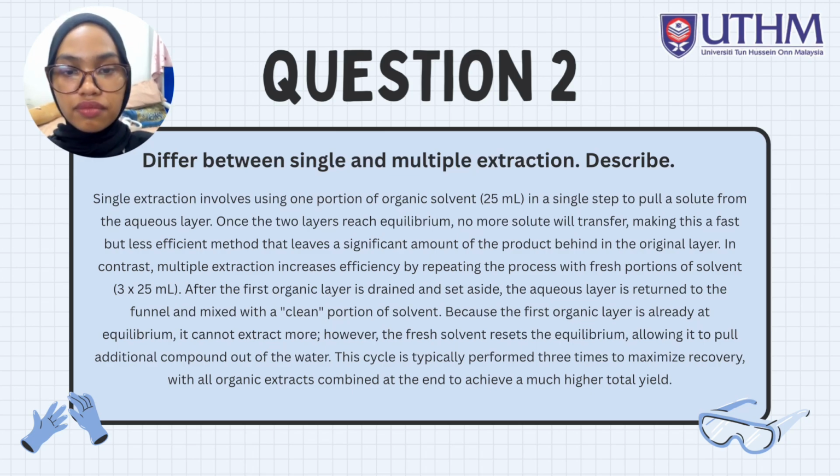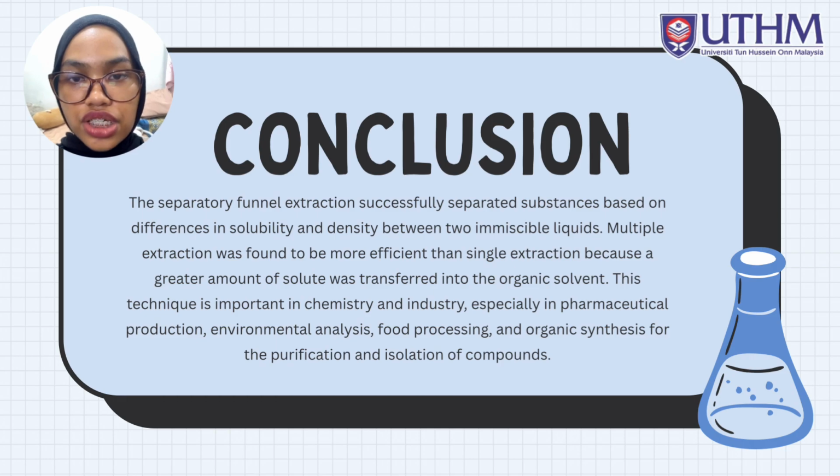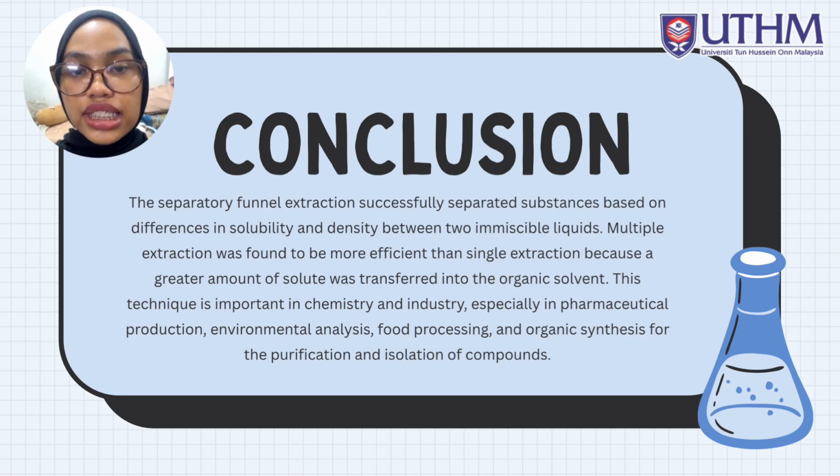So for the conclusion, the separatory funnel extraction successfully separated substances based on difference in solubility and density between two immiscible liquids. Multiple extraction was found to be more efficient than single extraction because a greater amount of solute was transferred into the organic solvent. This technique is important in chemistry and industry, especially in pharmaceutical production, environmental analysis, food processing, and organic synthesis for purification and isolation of compounds.